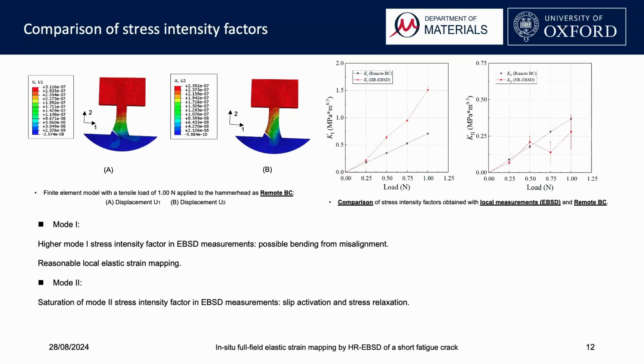And this is possibly due to the local plastic deformation ahead of the crack tip, and the stress is relaxed here. So this means our method measures the actual elastic strain field, which is critical to fatigue crack propagation, because this plastic deformation is critical to fatigue crack propagation.